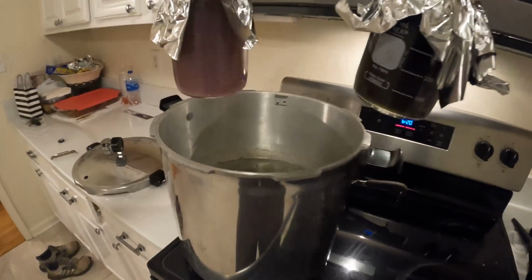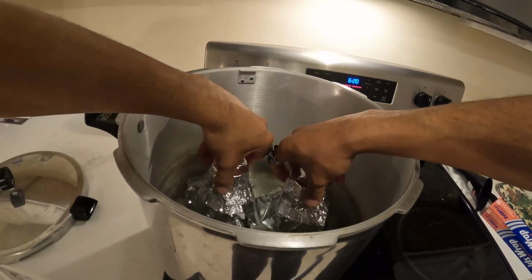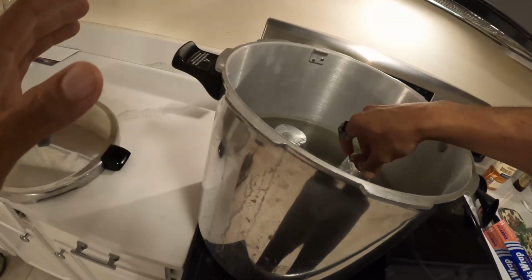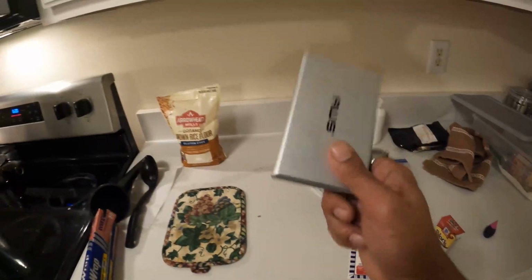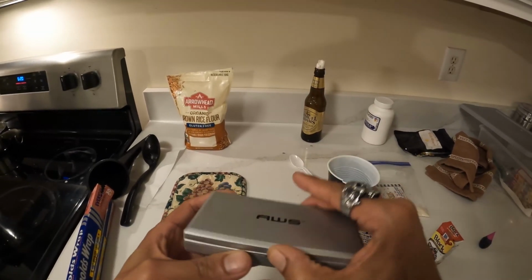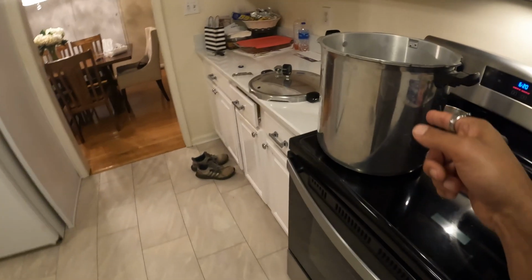Remember to make sure you have your pressure cooker to the right height of water so that it helps prevent the boil over as it cools. And make sure you have a scale. Don't get in the mycology without a scale. You're going to need a scale. There's no way around it. So make the investment. The biggest investment that you're going to deal with is this pressure cooker right here.